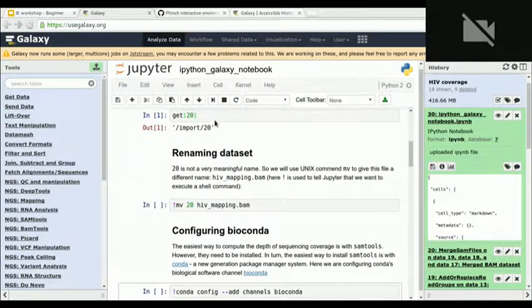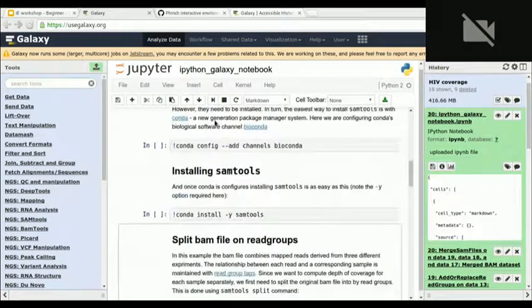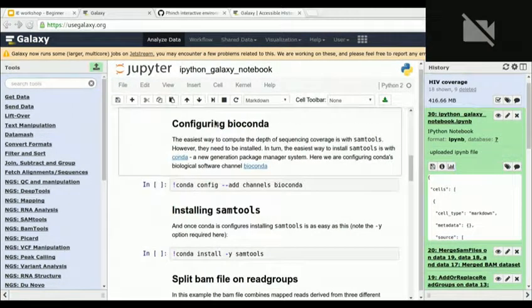So I actually need SAMtools. So I need to install SAMtools. Fortunately, the Docker container which you're starting out here is configured with Conda. How many of you have heard of Conda? So some number of you. Basically, it's one of the fashionable package managers, which works really well.